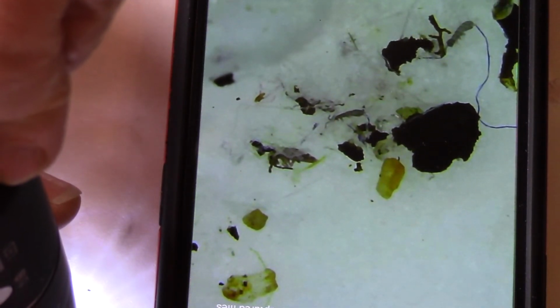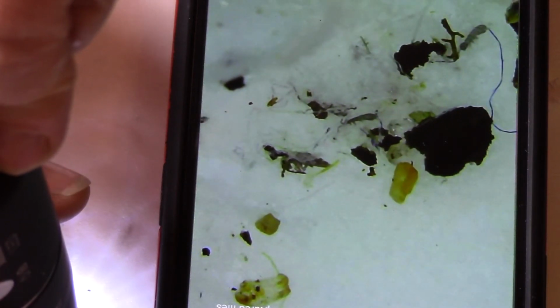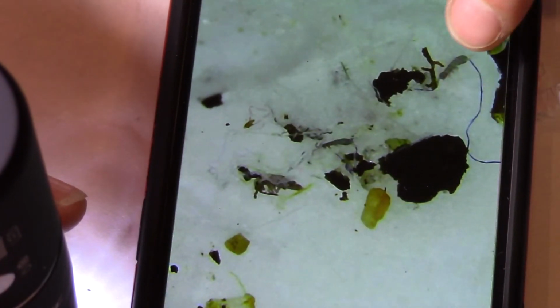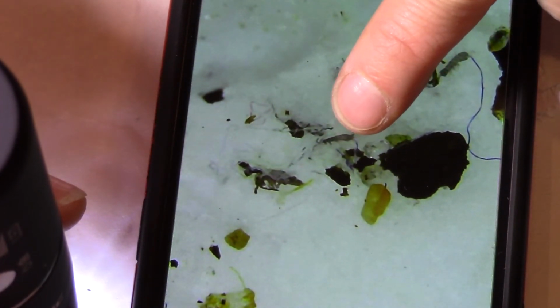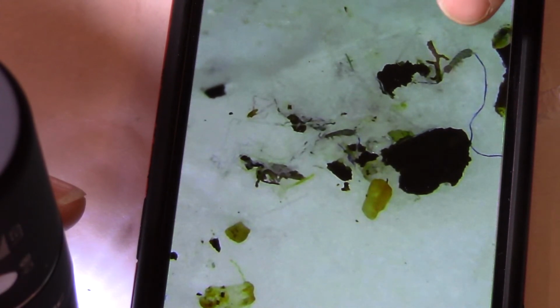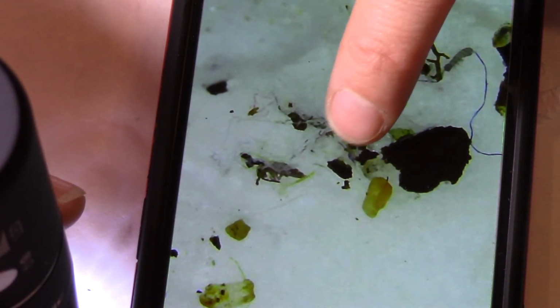Oh, look, there's a little tiny, even tinier little springtail. Here, I've got one down here and another one there. And I'm wondering if that's another one in there. Wow, we totally couldn't even see that with our little handmade microscopes. So I never saw those ones coming. I was looking at the thing that was over here that I thought was a mite. That just looks like bits of gravel.